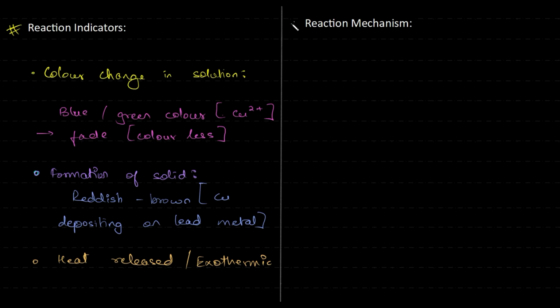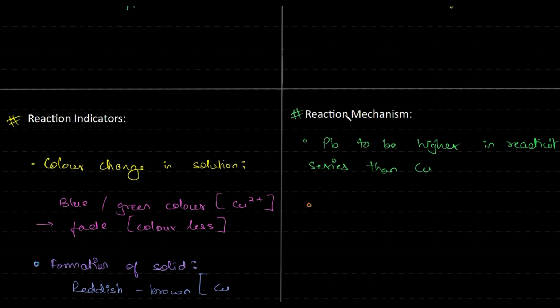The reason is quite simple. You have, in this case, lead being higher in the reactivity series than copper. It's as simple as that. And why is there a release of heat? Quite simple.